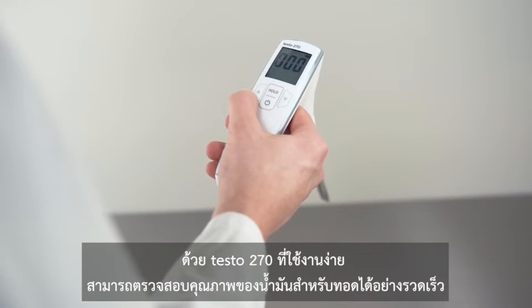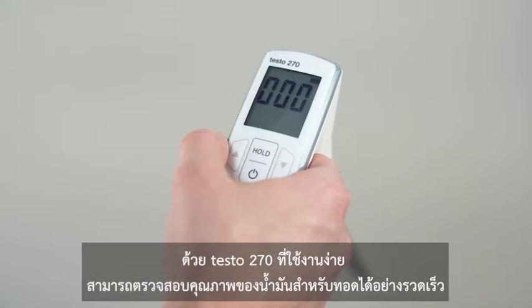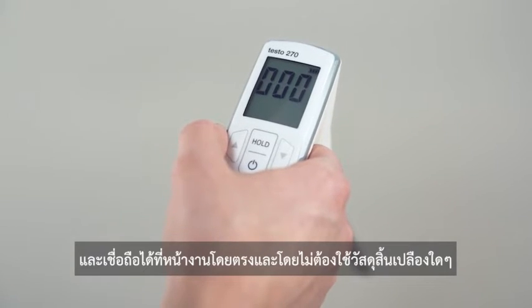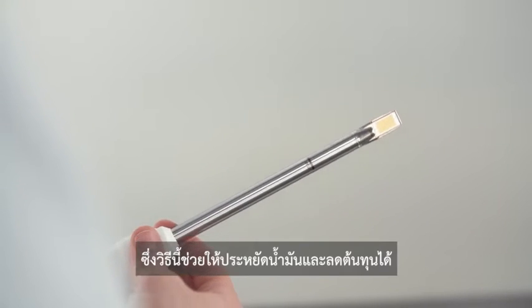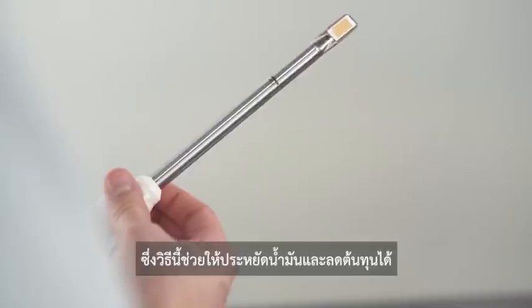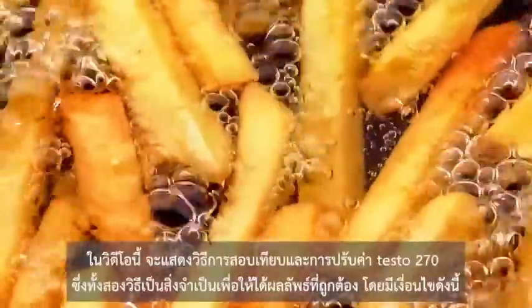With the handy testo 270 you can determine the quality of frying oil quickly and reliably directly on site and without any consumable materials. In this video we'll show you how to calibrate and adjust the testo 270.